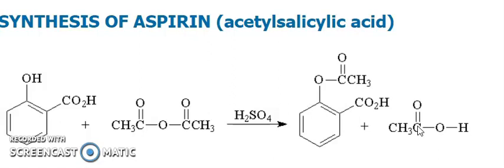For taking 5 drops, you have to use a dropper. H2SO4 is highly corrosive. Swirl the flask gently until the salicylic acid dissolves. Slowly add and try to dissolve the salicylic acid.